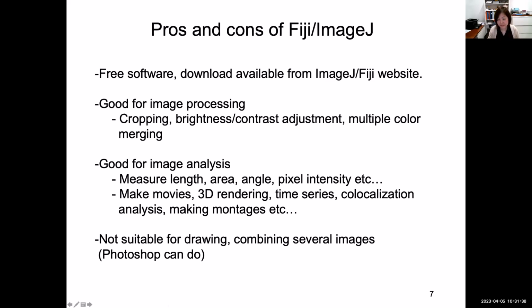The con of Fiji ImageJ is that this software is not suitable for drawing or combining several images. For example, for publications, if you want to put 3-4 images together to make an image tile, then you cannot use ImageJ.